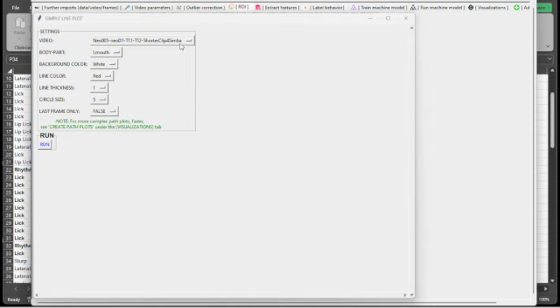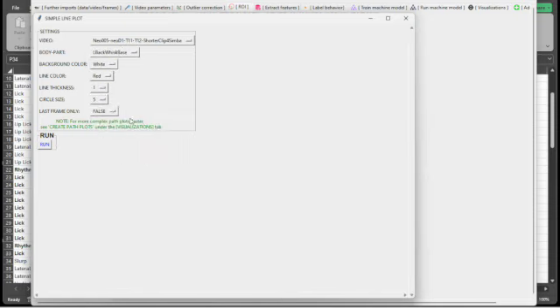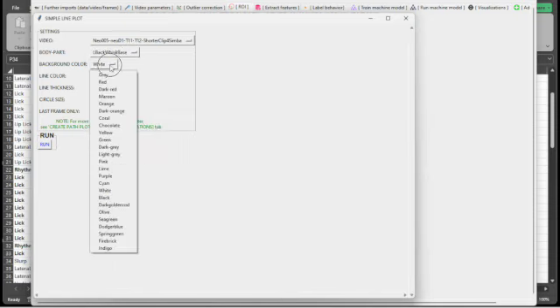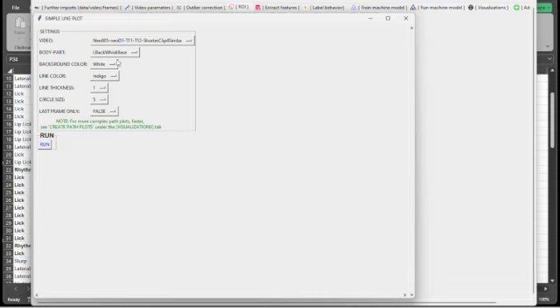So this might be more helpful in me trying to find out the whisker movement. So I'm going to select that body part again, left back whisk base. Background color can remain white. I'll make the line color indigo to match the ROI box. The line thickness can be 1. I'll make the circle a little smaller. And then select run.